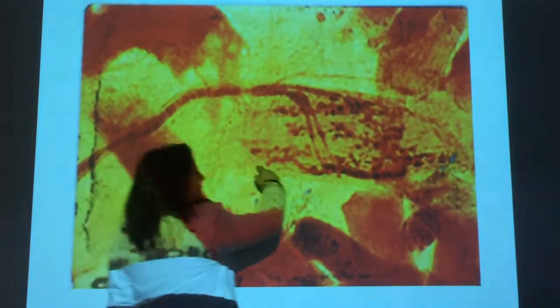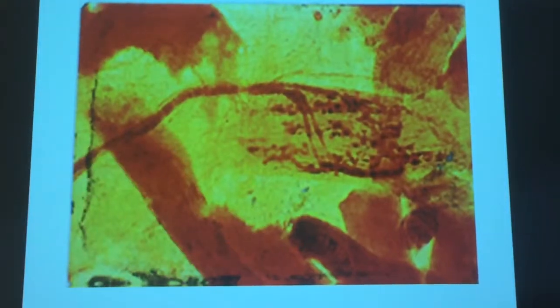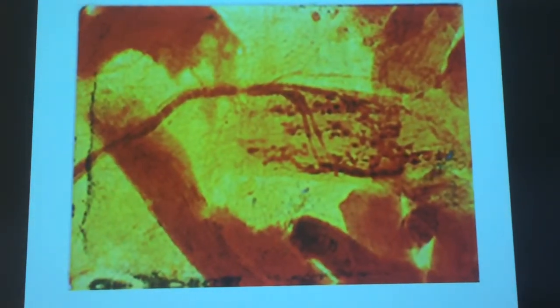This is the tendon. So this is a Golgi tendon or Golgi tendon organ. Sometimes they call it a capsule. So this is the Golgi tendon organ or Golgi tendon capsule right here. Either one you want to call it is fine with me. Okay, stop.